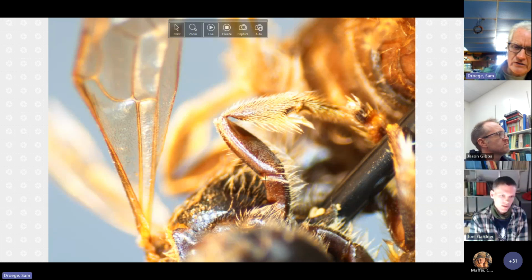When you say outer face, is this the correct one? Facing the camera, like the face facing the camera. Oh, I see. Okay, the flat other face. In other species, the trochanter will be more rounded, more cylindrical, like the femur and tibia.